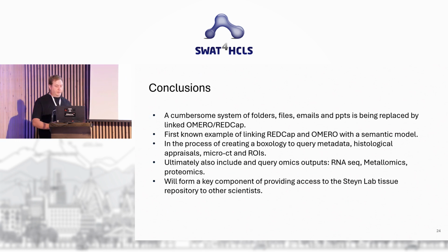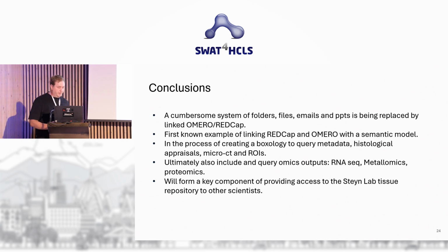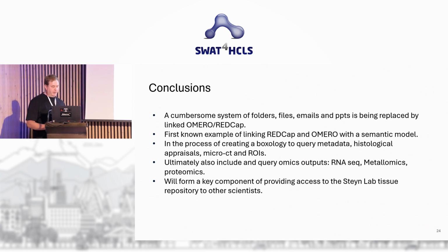So to conclude, the rather cumbersome system that we had before is being replaced with this linked OMERO REDCap. As far as we know, this is the first example of linking REDCap and OMERO with a semantic model, an attempt to do so. We're in the process of creating a boxology to put on top of this, and ultimately want to include as many outputs as possible.